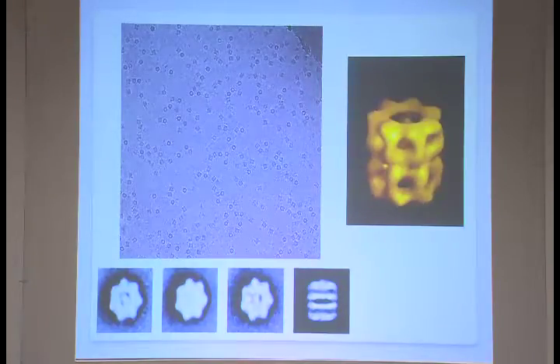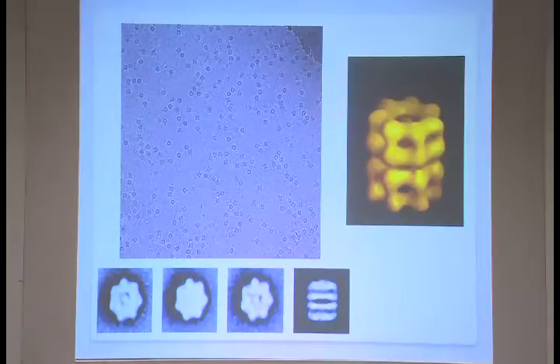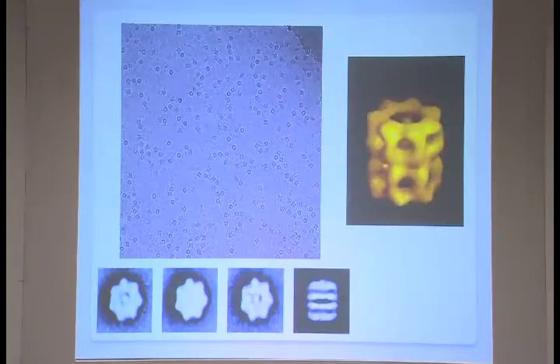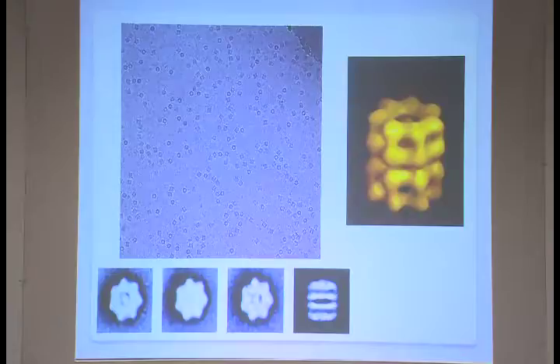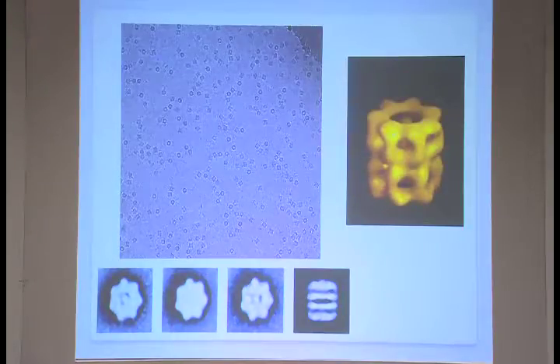But how, if there are big changes in the structure, which is really visible here in this movie, can you really explain it with some atomic structure? Can we really say that the atomic structure is an accurate one? No, because it has associated errors. Probably the C alpha or phosphate backbone has some 1 angstrom plus or minus error, or 2 angstrom, but all the side chain predictions are not correct.